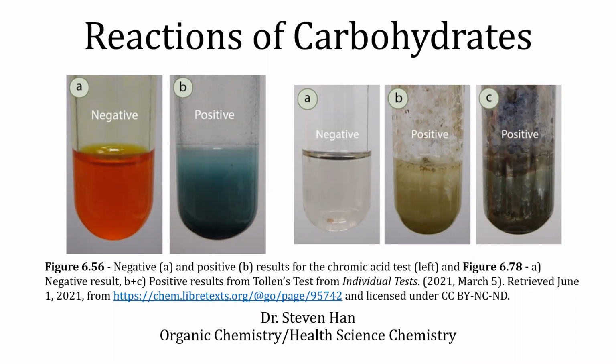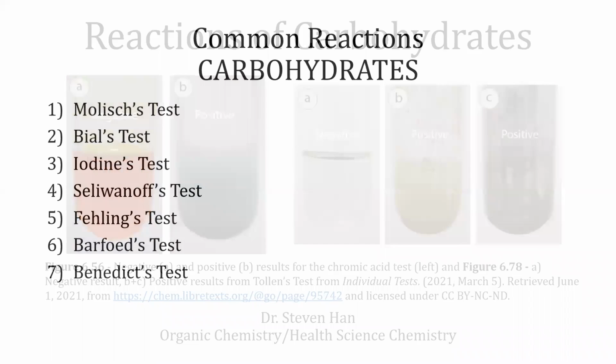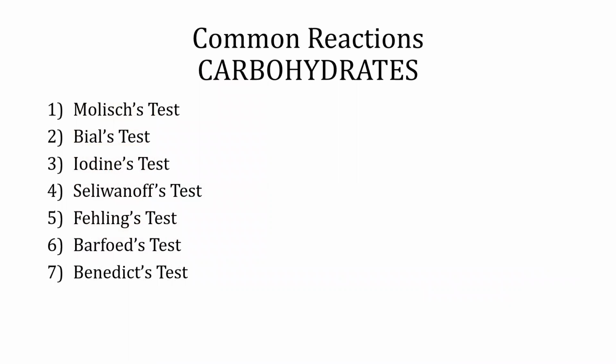This lecture is on reactions of carbohydrates. Some of the most common reactions include the Molisch, Bial, Iodine, Seliwanoff, Fehling, Barfoed, and Benedict's test.